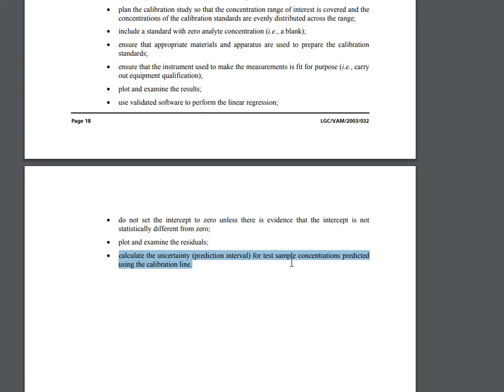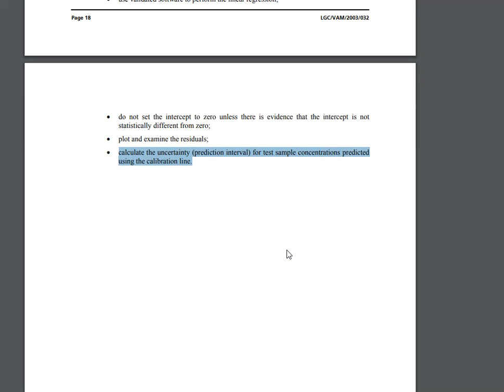So what I'm saying to you is don't take everything for granted. Really fully understand where these numbers are coming from, what the machine is doing, what the software is doing for you. So that way you can at least talk the game when someone says, what's the problem? What's going on here? Or tell me about what you're doing today. That could be a coworker, it could be a manager, it could be an auditor. Make sure that you make yourself look good when you're presented with those types of questions.